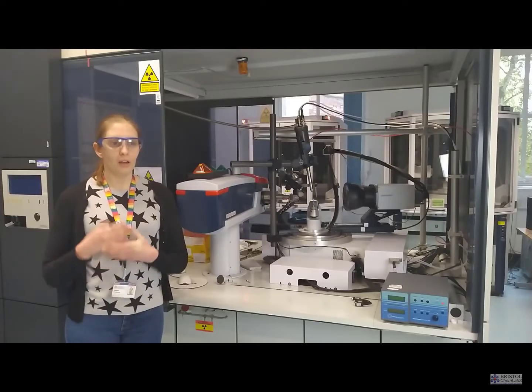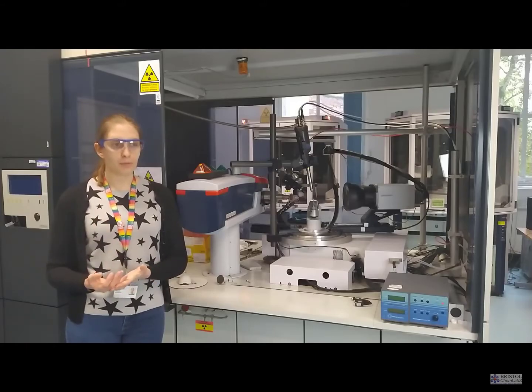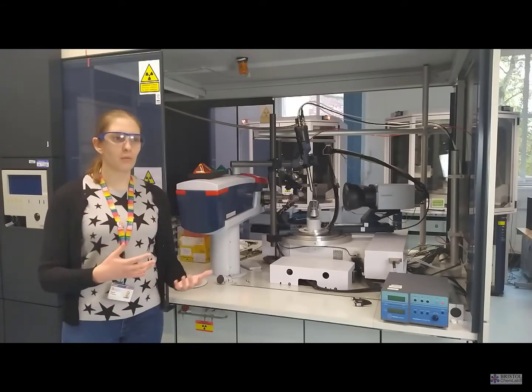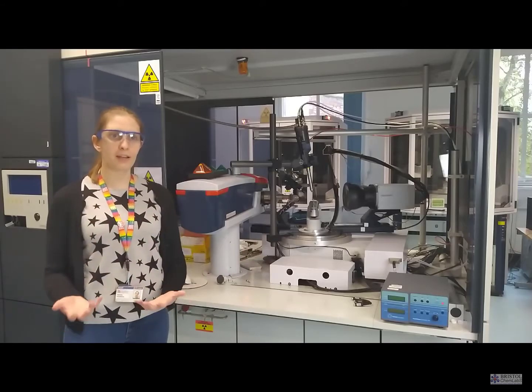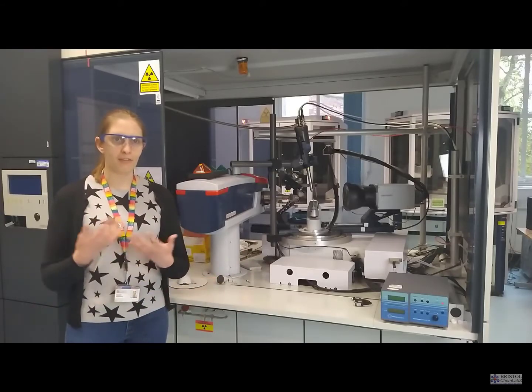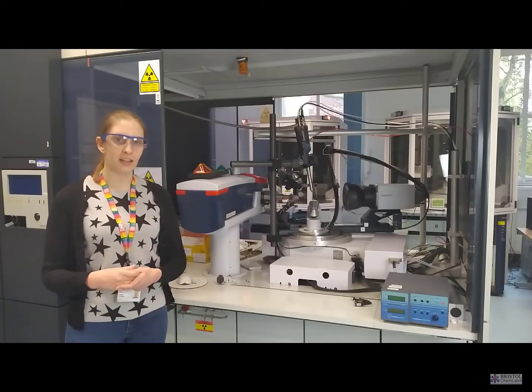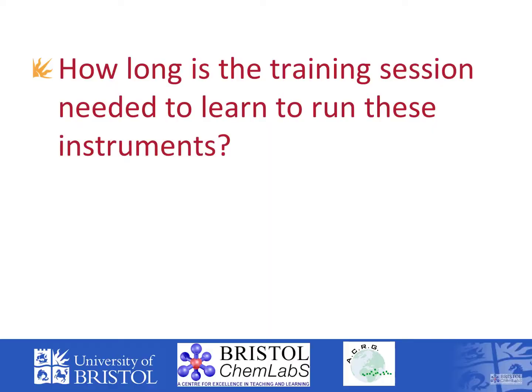Yeah, normally both. So we get a mixture. Anybody that's producing structures can get trained to use the relevant instruments. For the undergrads, if that's not the main focus of their project, sometimes they don't want to learn to run all the samples themselves if they're only going to do one over that whole project, but they can still come down and see how it works. But if it's going to be quite a big part of their project, then they can get trained the same as the PhD research students as well.